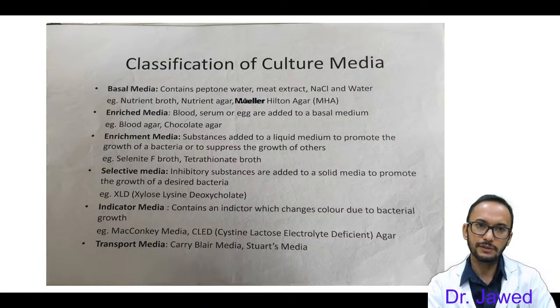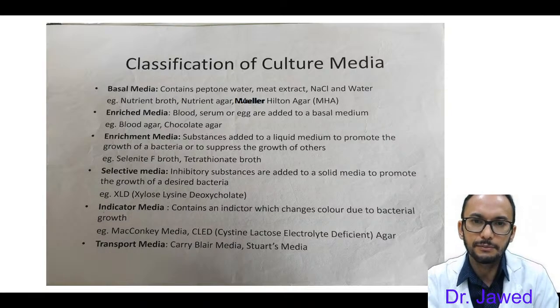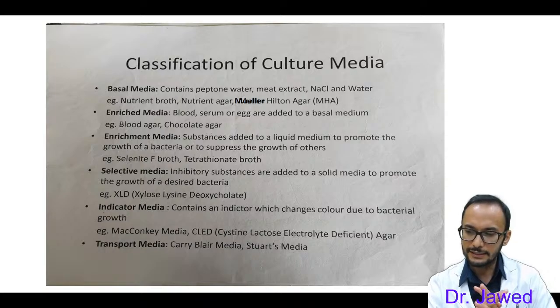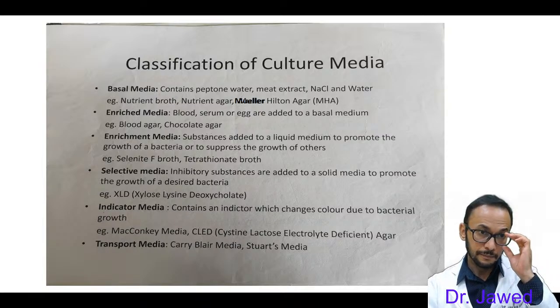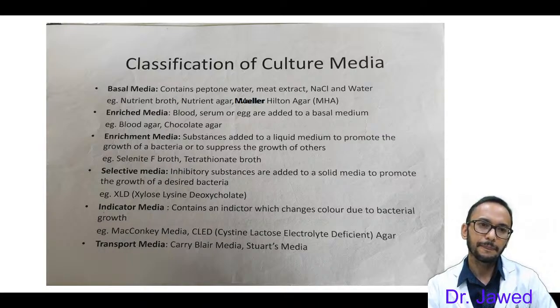Next is the classification of culture media. We'll talk about the culture media that is used in our laboratory, the common culture media. So this is the classification. We have basal media. What is basal media? Basically it consists of the basal nutrients that are required. So it's made up of peptone water.